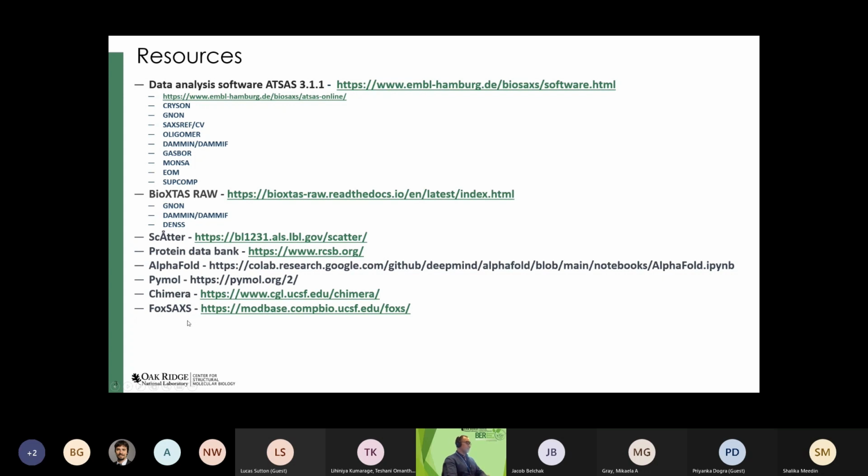And if you want to compare SAXS data, for instance, you can also use FoXS, which is a web server that does fast calculations of SAXS profiles. In general, you will probably have both data sets. You have SAXS, for instance, and you want to do comparisons with the SAXS. So today in my talk, I'm going to go over more on BioXTAS RAW and how you analyze the data.